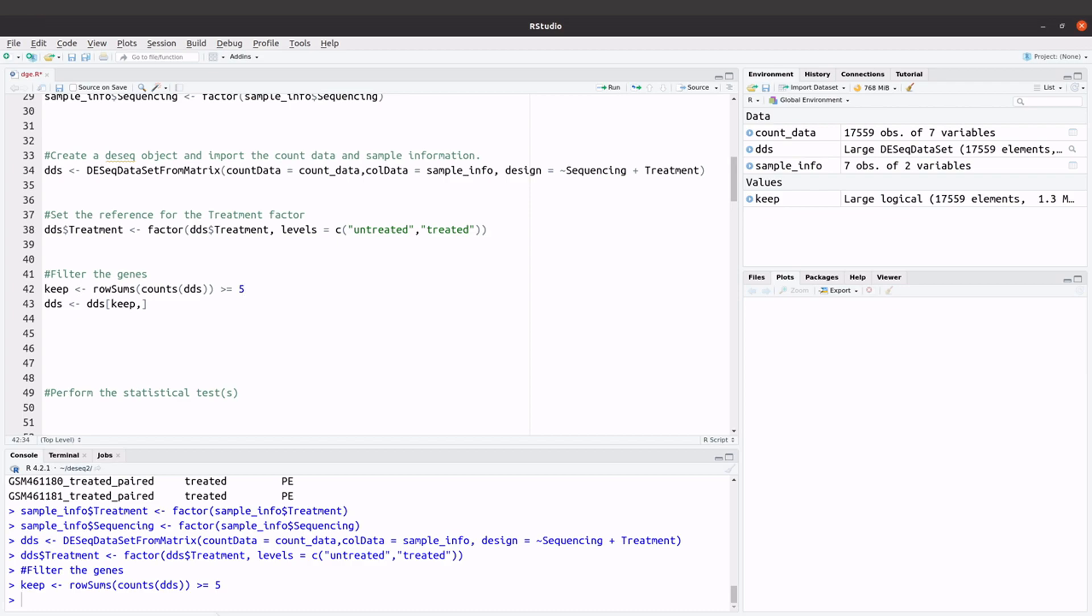So make sure that whatever number you are going to use, you can justify it. That's what I'll say here. Okay, so let's get this, let's subset and get our yes.